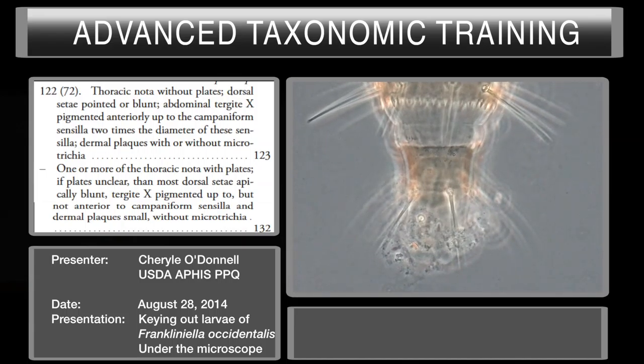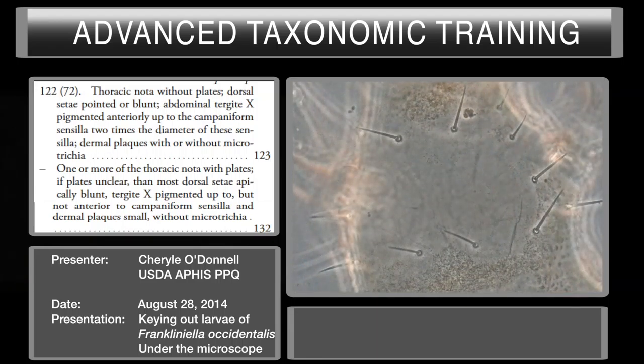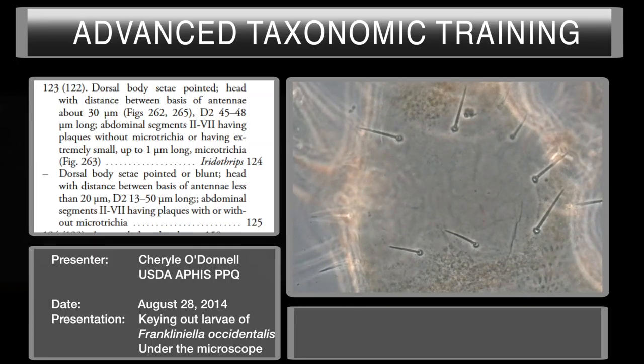Now we're going to look at the thoracic nota, which is essentially the main body of the thorax, and it's asking if it has plates or is absent of plates. You can see there are plaques on the segments themselves, and there is an absence of them on the thoracic nota. So we actually fit the first half of this couplet, which takes us to couplet number 123 on page 150.